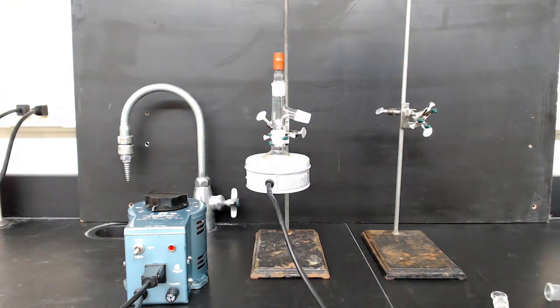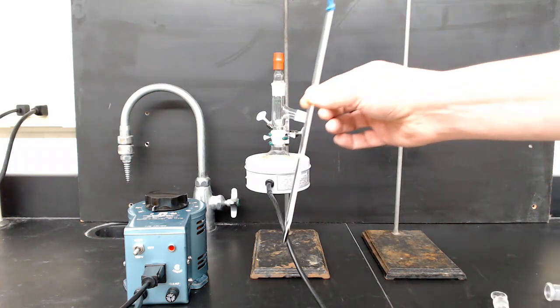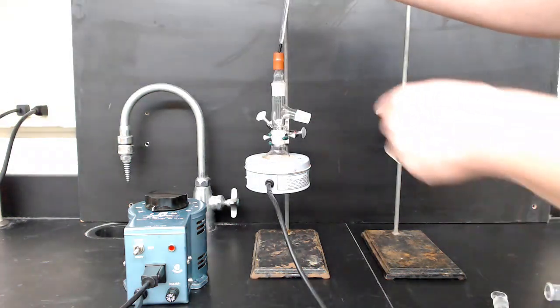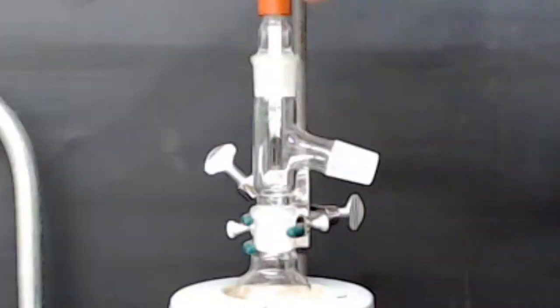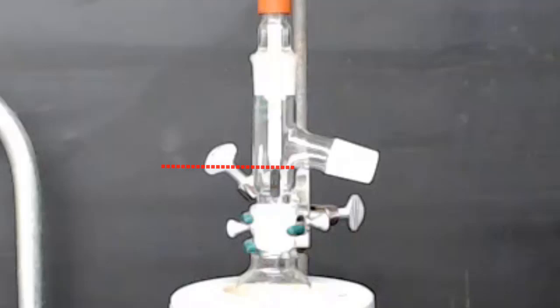Next, push the thermometer through the rubber boot and into the apparatus. You want to make sure that the bulb is in the right location. This is important for getting an accurate temperature. The bulb should be just below the elbow of the three-way distillation head, as shown here in this picture.